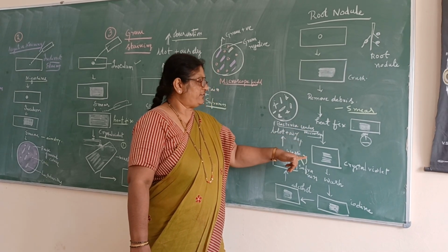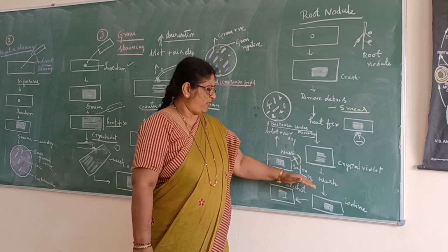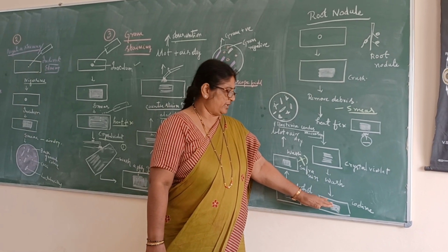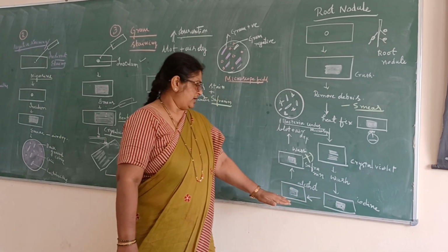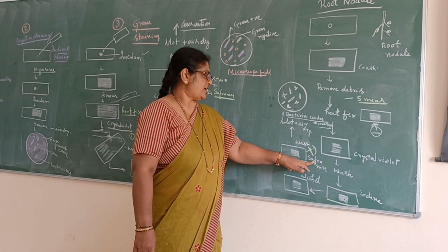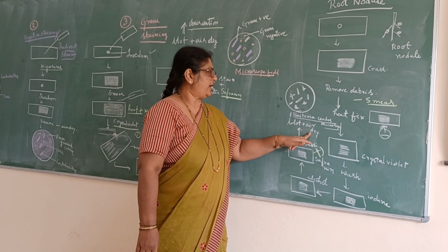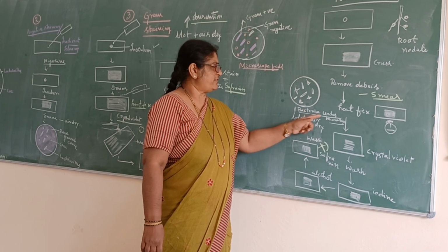After heat fixing, we use the crystal violet stain, wash, then the mordant iodine, then alcohol for decolorization, then counter staining with safranin, blot the slide and air dry. The slide is ready for observation.